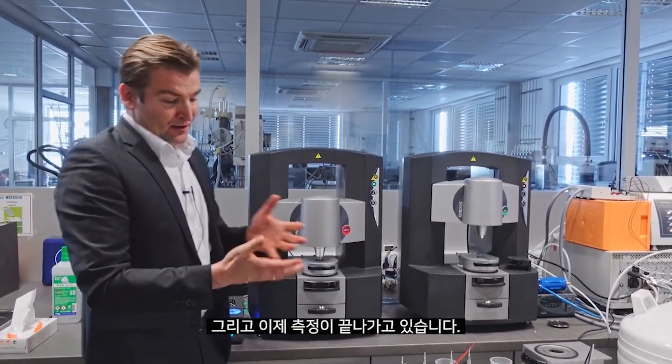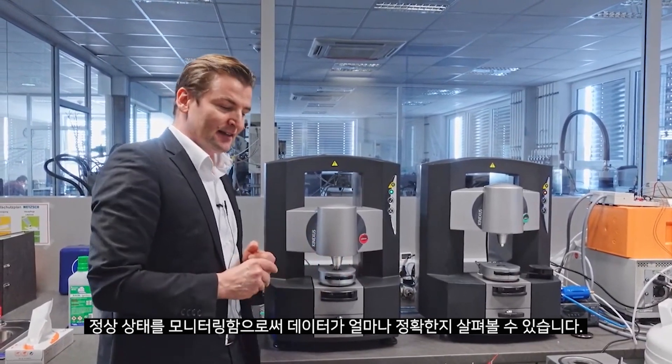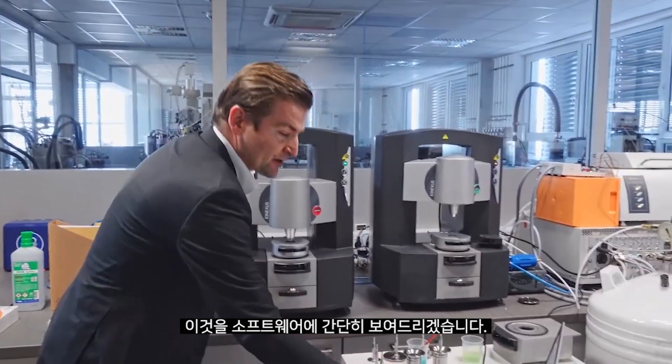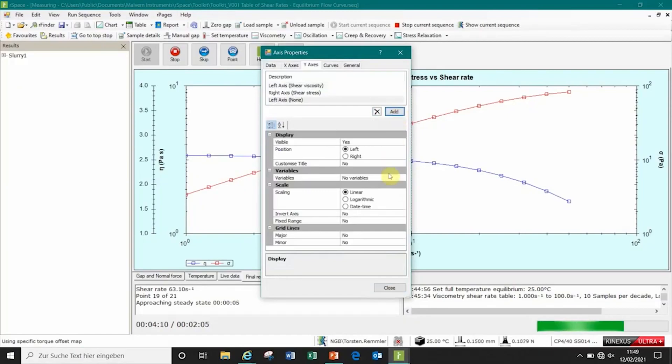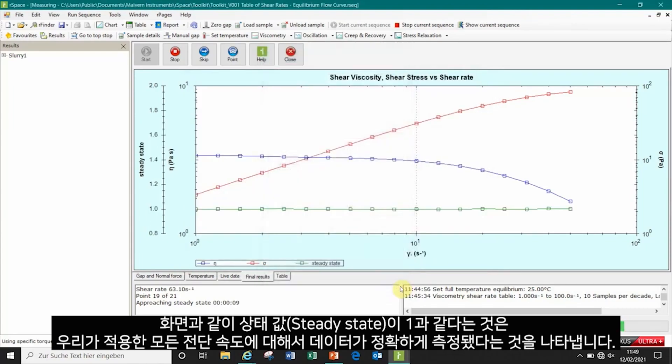Now we are close to finishing our measurement. We can check how accurate the data are by monitoring the steady state. A value equal to 1 indicates that you have measured correctly, and as can be seen for all the shear rates we have applied, we are close to the value of 1.